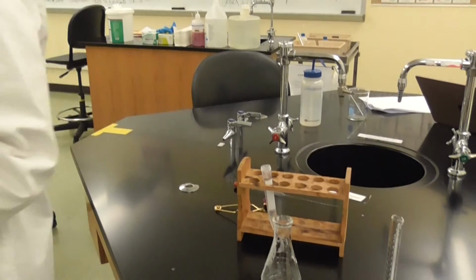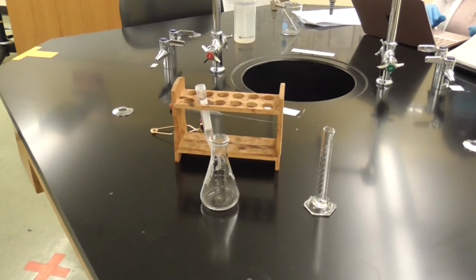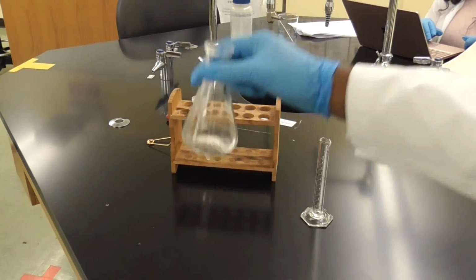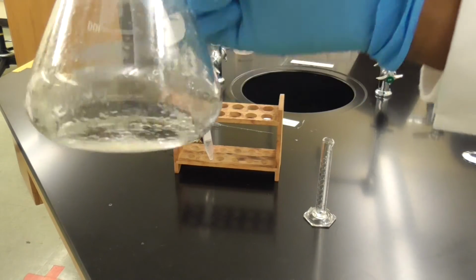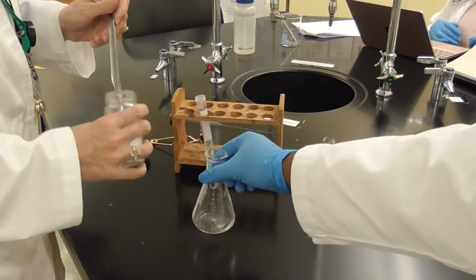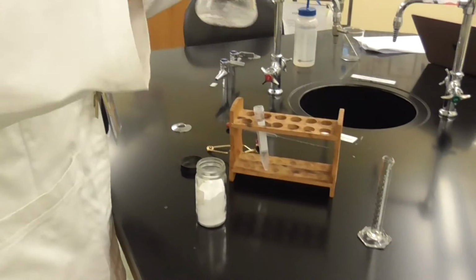I'm going to bring some of the sodium. On the tip of the spatula, we're going to add a little bit of the sodium.